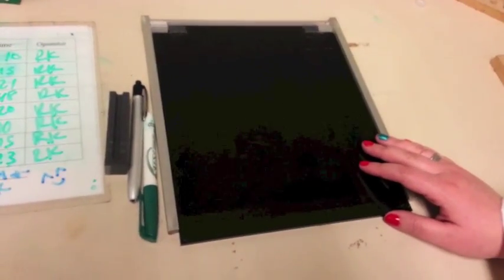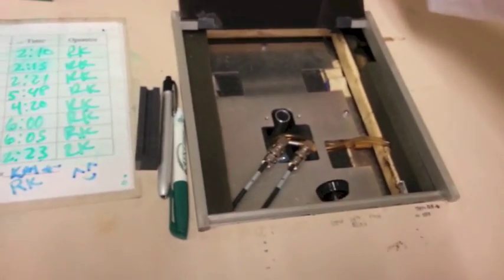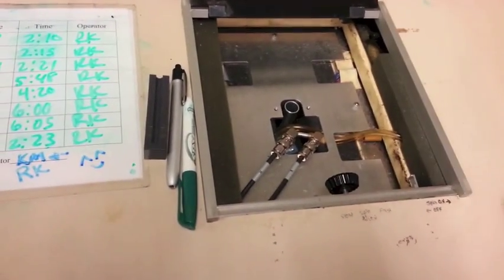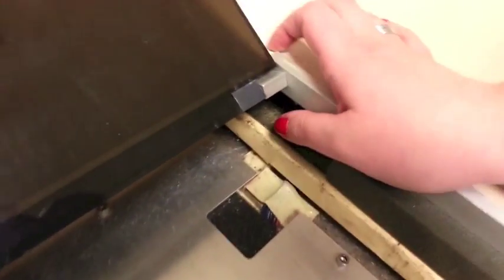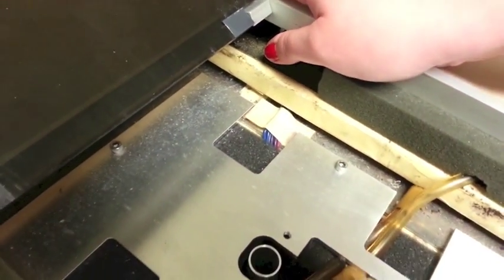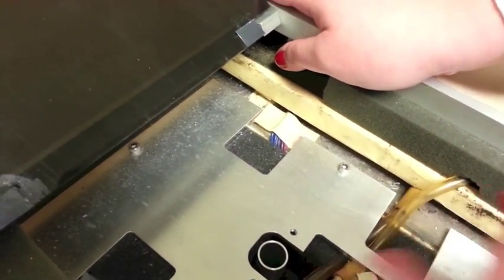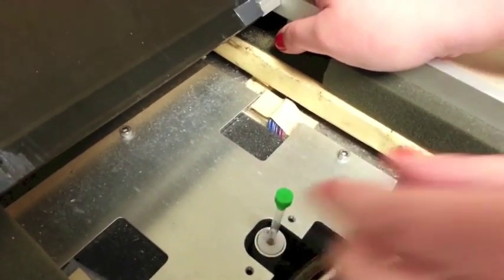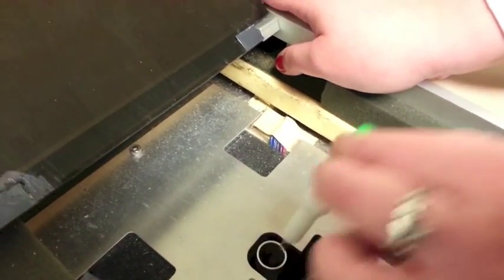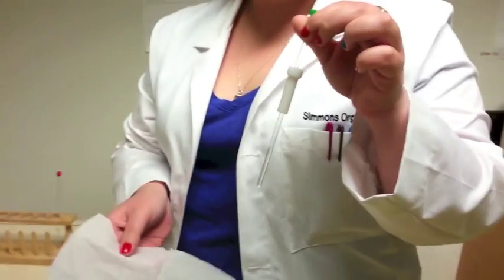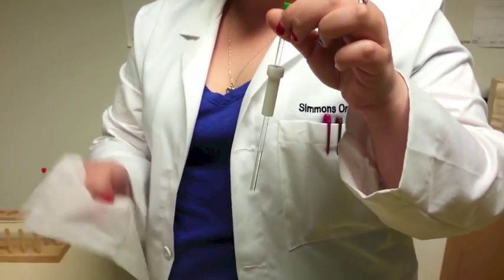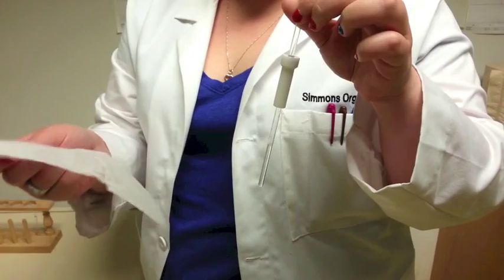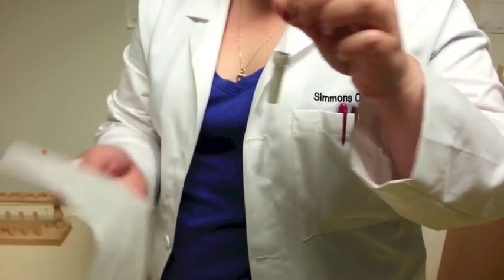When you're ready to put your sample in the NMR, come over to the machine and lift up the lid. There's always a sample in the NMR, so you want to use this button over here to eject the sample. Slowly push in, and it will rise out of the opening. You want to grab the upper part of the sample, and then take a Kim wipe to take the bobbin off. You never want to touch the bobbin with your bare hands, because you can get dirt and other particulates on it that will mess up the spinning.